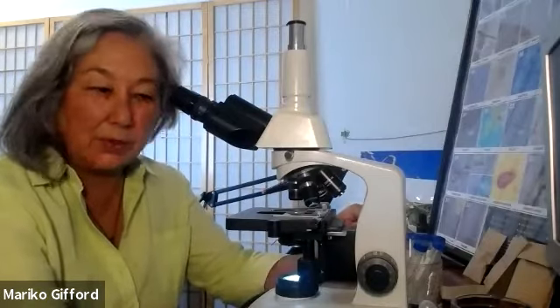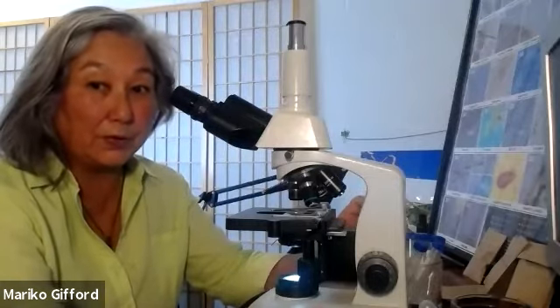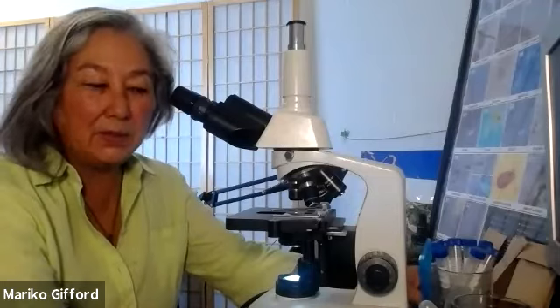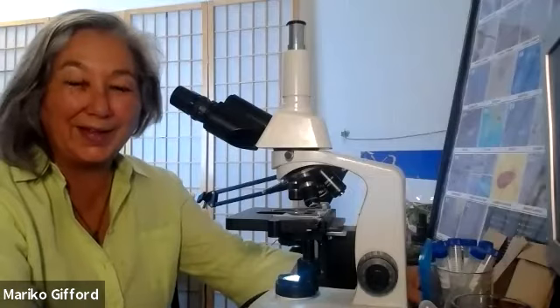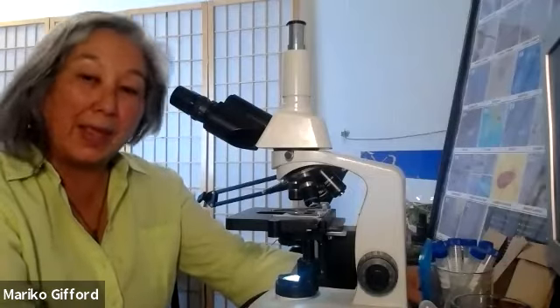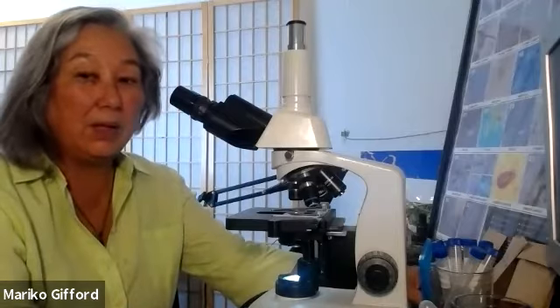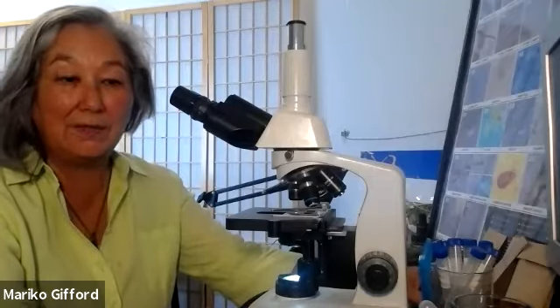And you have to know that when you start to see things in there, you start to see anaerobic bacteria, for example, rotifers, insect larvae, which we have seen in some of our slides. That means that you want to do some troubleshooting for that. It's not toss the whole thing. You want to start knowing that you can add fungi food to that. You want predators to those to start inhabiting that pile.